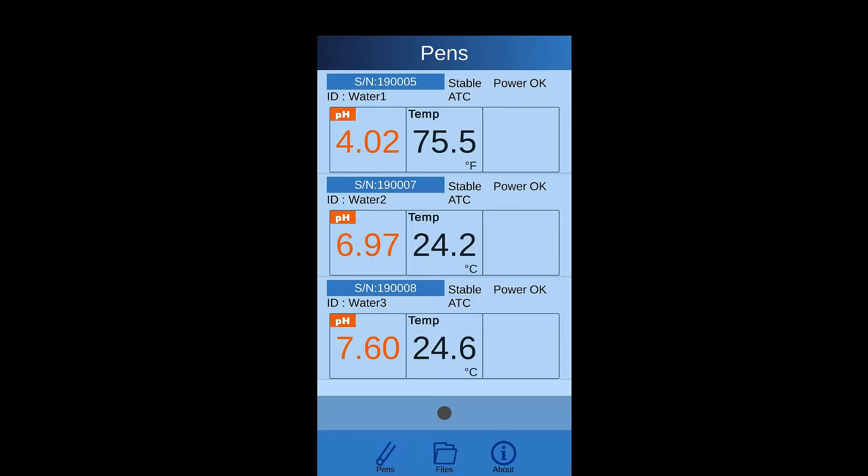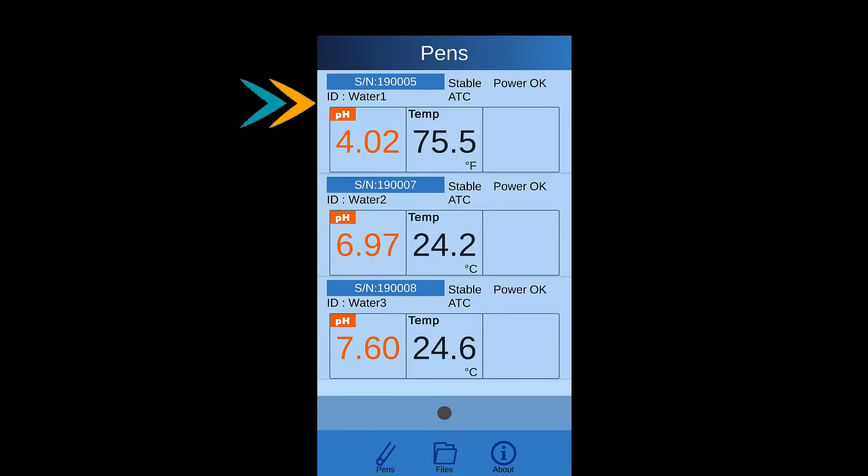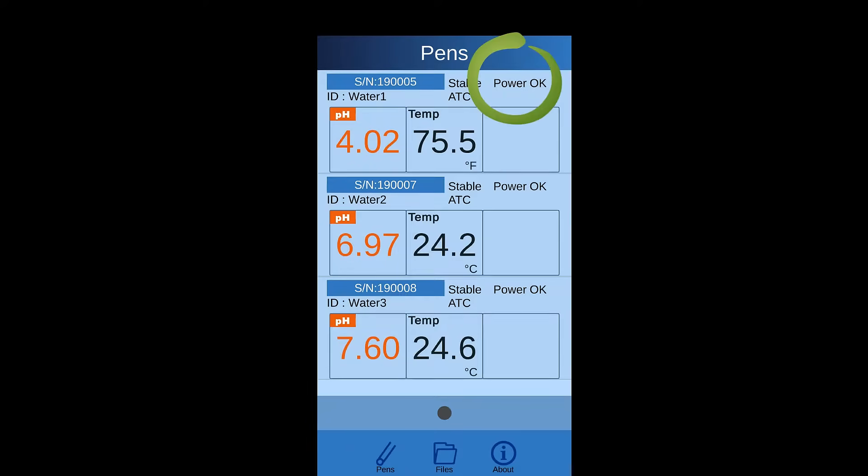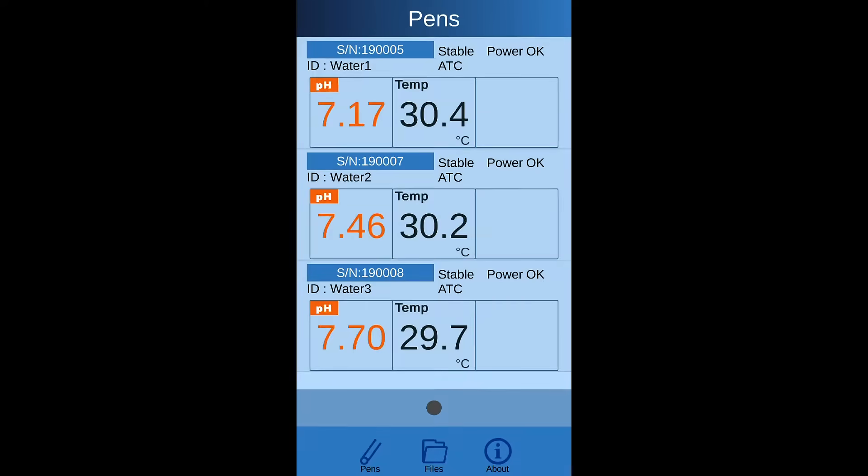The listed data on the app is by serial number and editable device name, following with measuring values, low battery indicator and stability indicator.